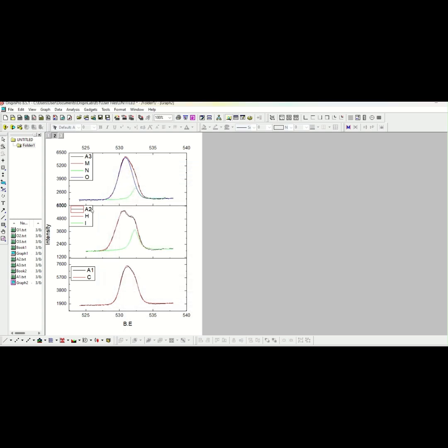Okay, for the third graph, we don't need to change anything because we have 4 y values and this graph has 4 y values. Now, depending upon your convenience, you can change the y axis values and also the x axis values and also the legend type, the color, and everything you want to make it look more beautiful.